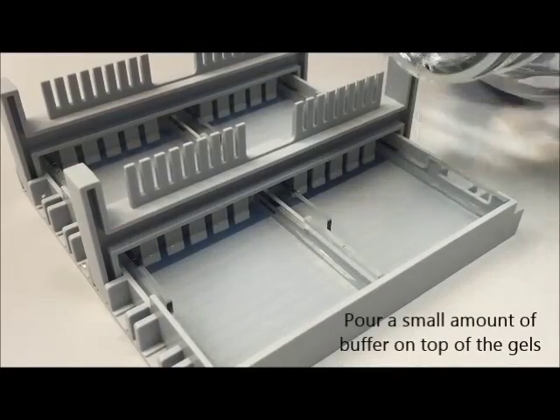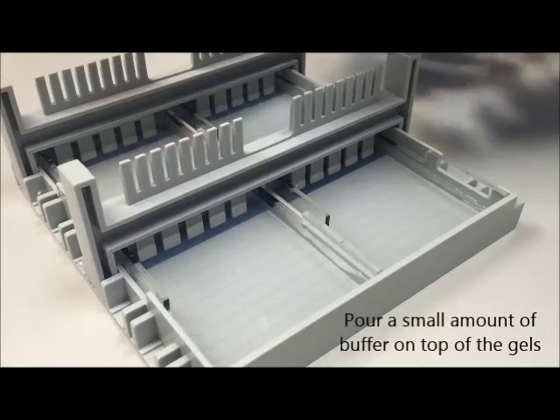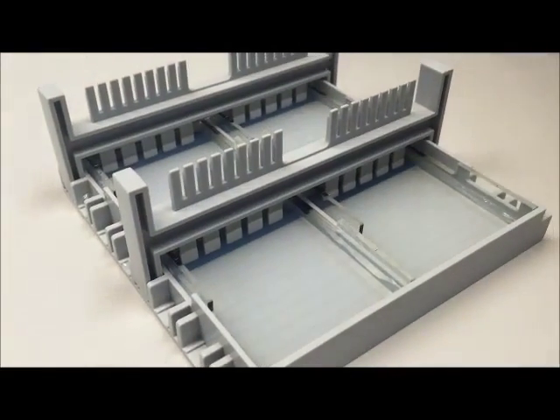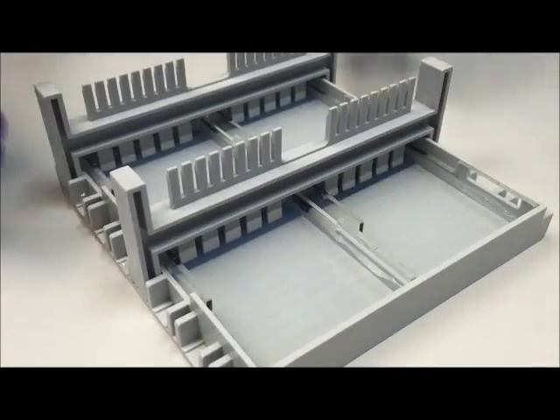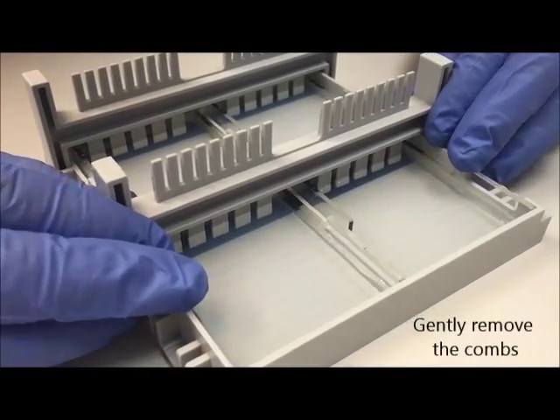Once the gels have solidified, it's time to remove the combs. First pour a small amount of buffer on top of the gels — this will facilitate removal of the combs. Gently pull the combs straight up and out of the gel, being careful not to tear them.